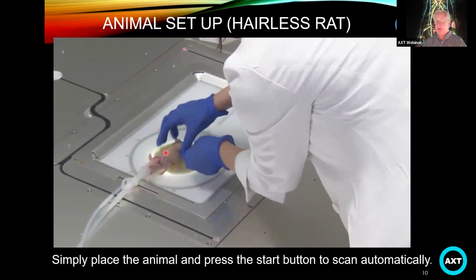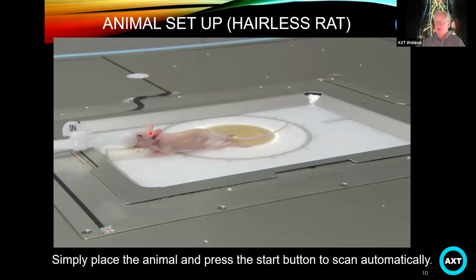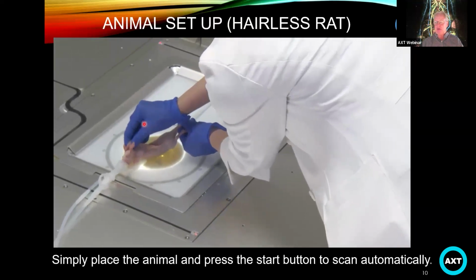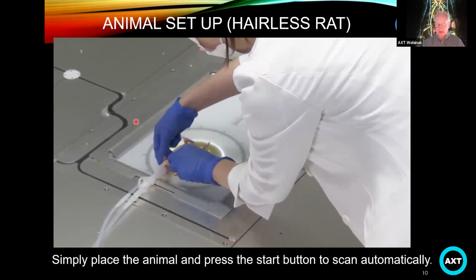But if we want to look at what this system is capable of in terms of its temporal resolution, if we kept the detector array static, we can actually do a maximum of 30 frames per second with the system. And remember that these are actually three-dimensional images in a 22 by 22 millimeter size.